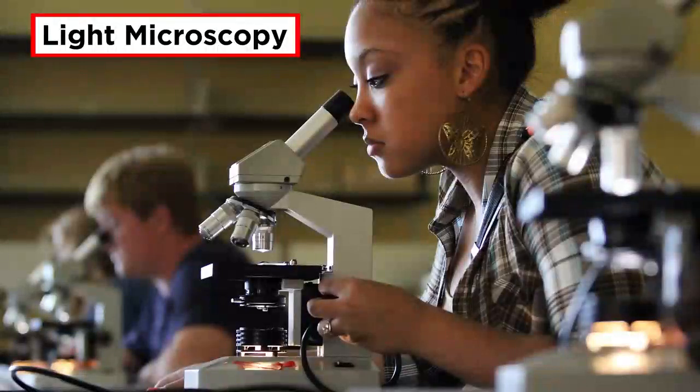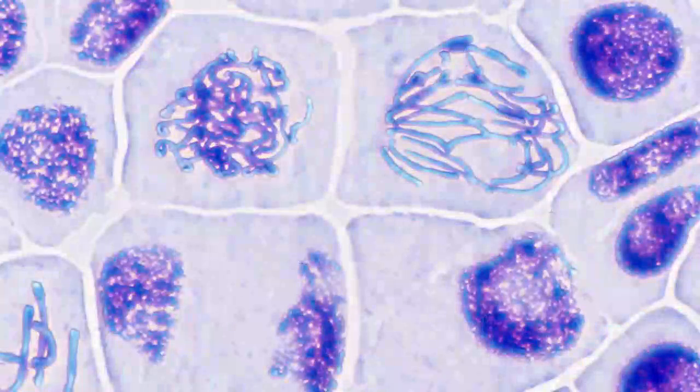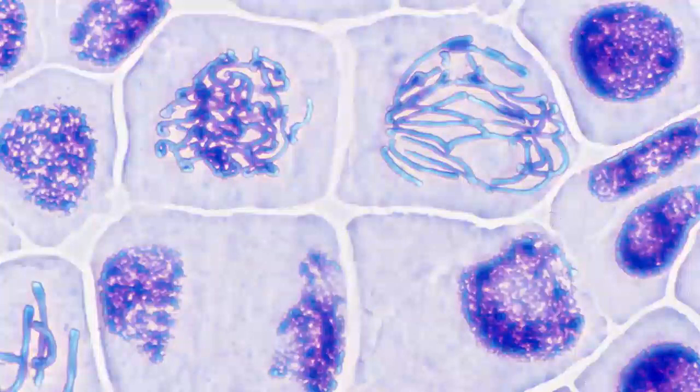We just learned all about light microscopy, which was the standard until the middle of the 20th century and remains tremendously useful today. But as we began to learn more about the microscopic world, using light microscopes that could visualize individual cells, we started to become curious about structures that are smaller than a cell, some details of which were difficult to visualize and study under standard light microscopes.